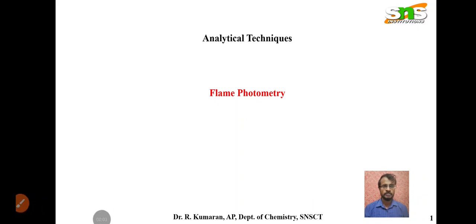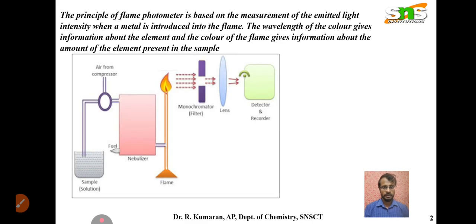Good morning everyone. In this video, we are going to discuss flame photometry, one of the important analytical techniques. We are now going to see some basic fundamentals of flame photometry with the instrumentation diagram.